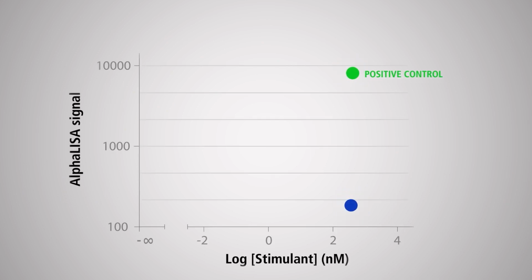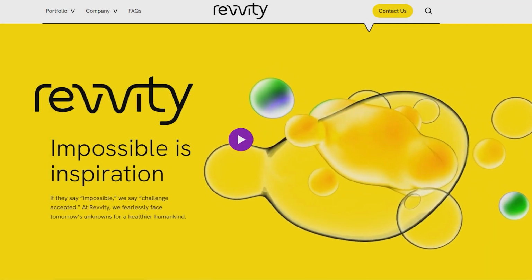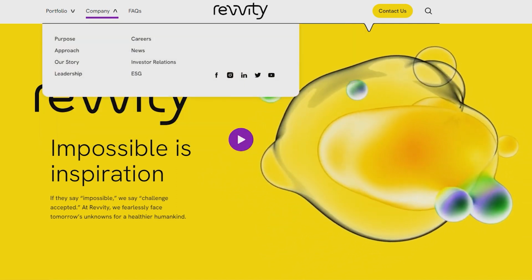Check the signal of the positive and negative control wells. The signal from phosphorylation assays is typically analyzed relative to your own controls. Congratulations! You have successfully implemented an AlphaLISA SureFire Ultra assay.